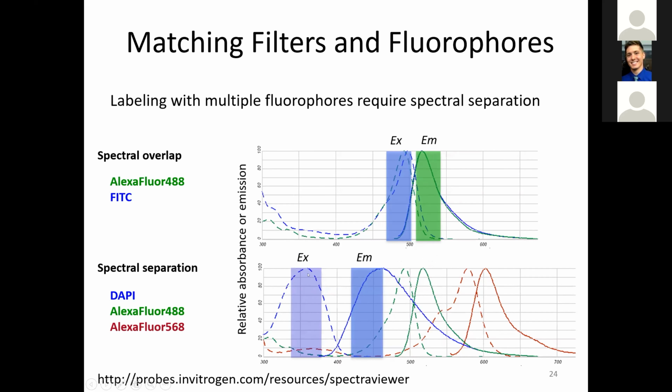If we add the DAPI, we have our excitation and our emission. With this DAPI filter, we are missing a lot of the DAPI curve. However, it's not such a concern because DAPI is such a bright fluorophore. It's fairly photostable. We can really afford to sacrifice a lot of the emission photons. Another thing you'll notice about the DAPI curve is that it really bleeds through into the rest of the visible spectrum. It would be impossible to capture all of it without suffering serious bleed through.